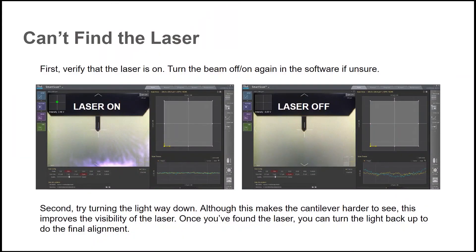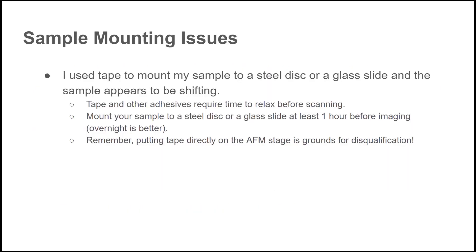Another common issue is trouble finding the laser. First, check that the laser is on — the intensity usually shows a negative value if the laser is off. Second, try turning the microscope light way down; although this makes the cantilever harder to see, it does improve the visibility of the laser. The final issue covered here has to do with mounting your sample. We don't recommend using tape to mount your sample, as the system vacuum is usually sufficient. But if it is necessary to mount a sample to a sample holder, tape and glues need time to relax after being applied, or it is possible to observe shifting in the sample. Remember to never apply tape directly to the AFM stage — doing so is grounds for disqualification.